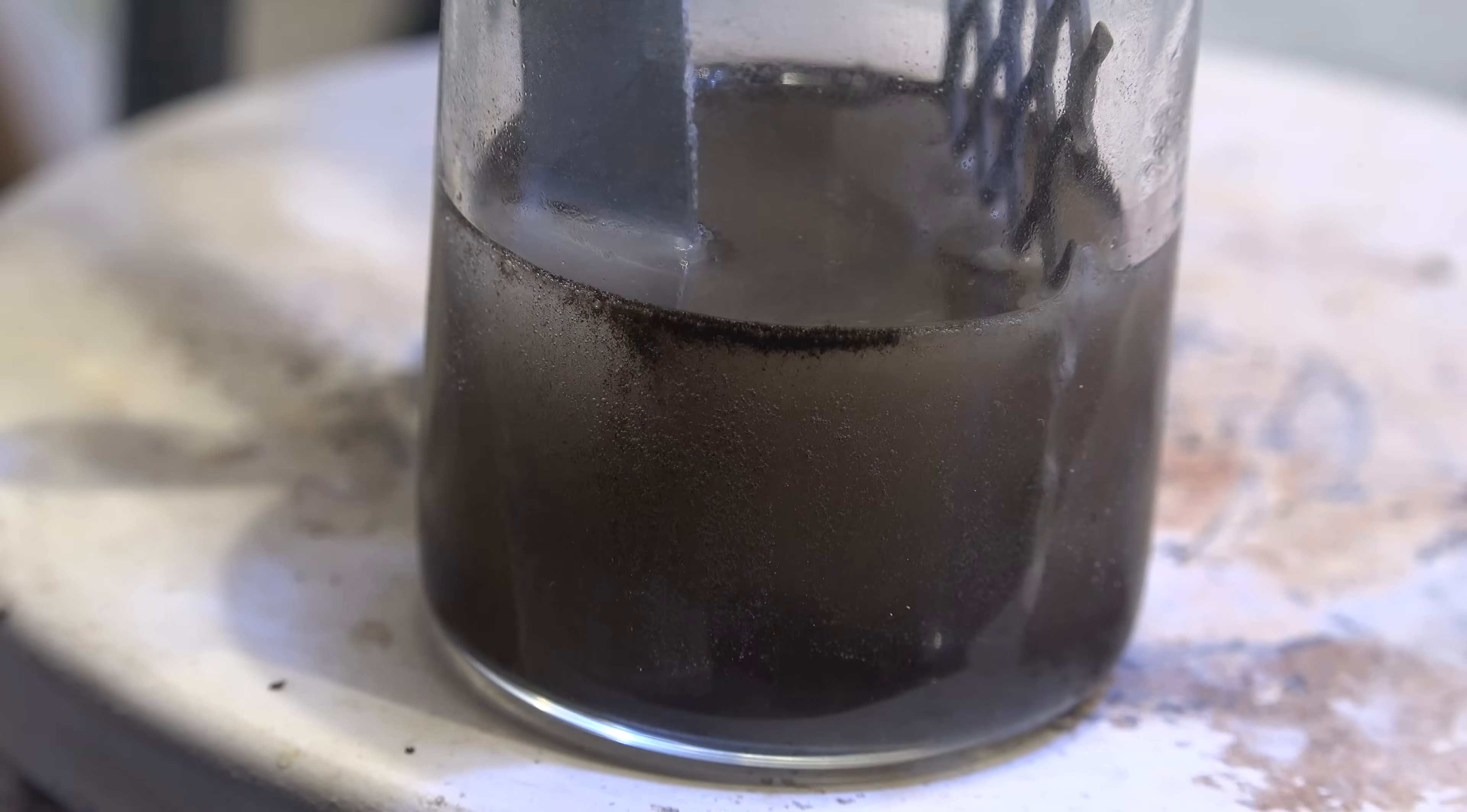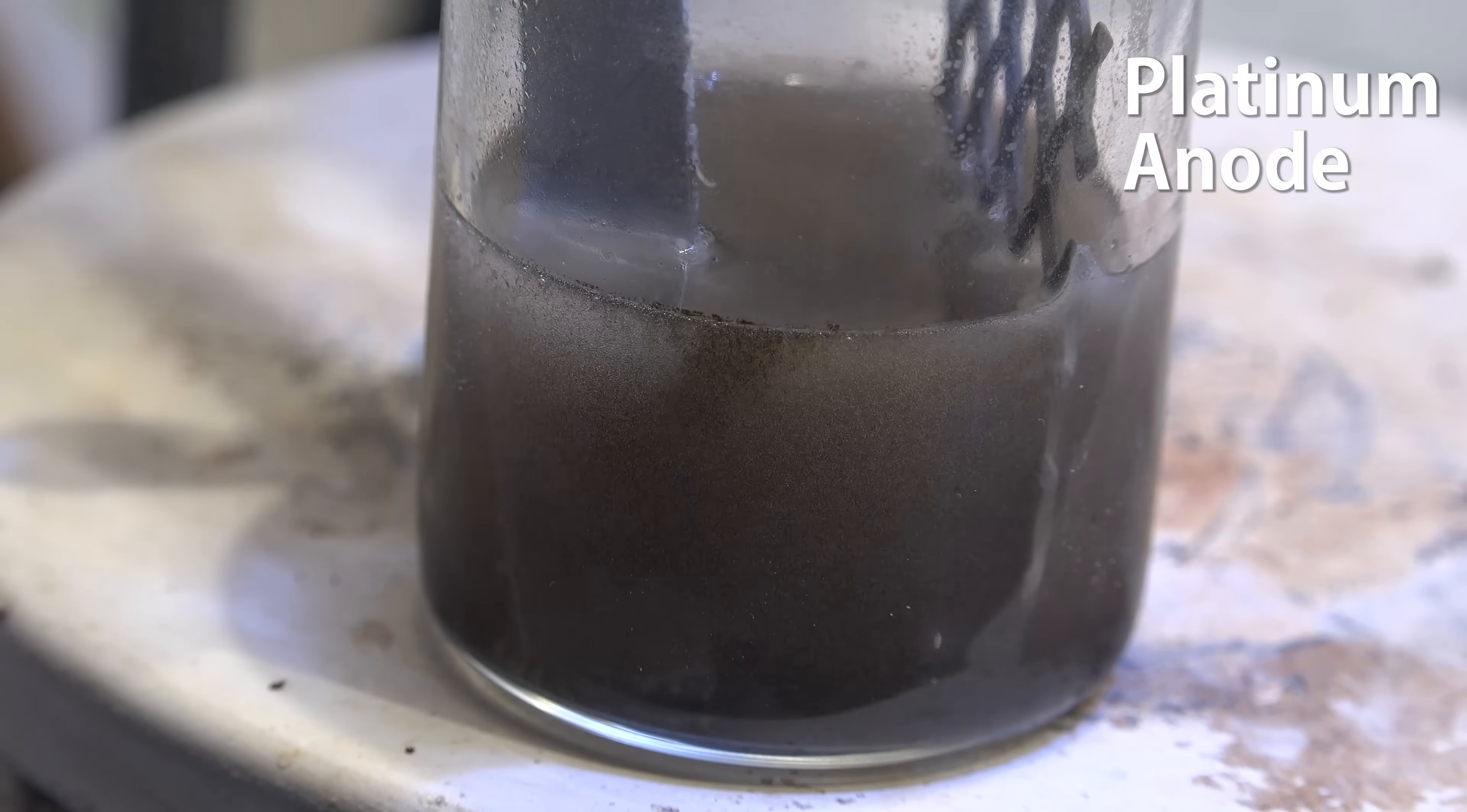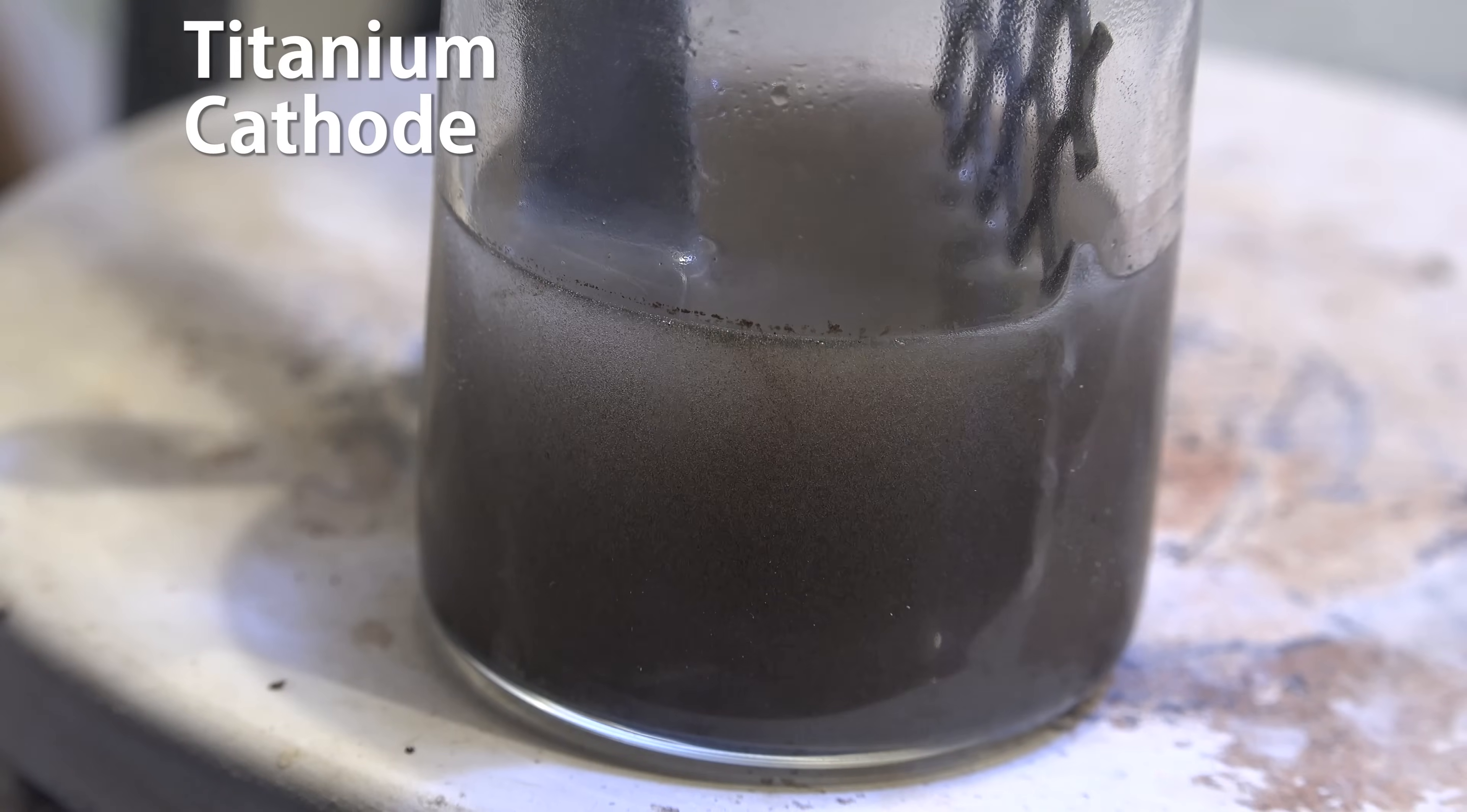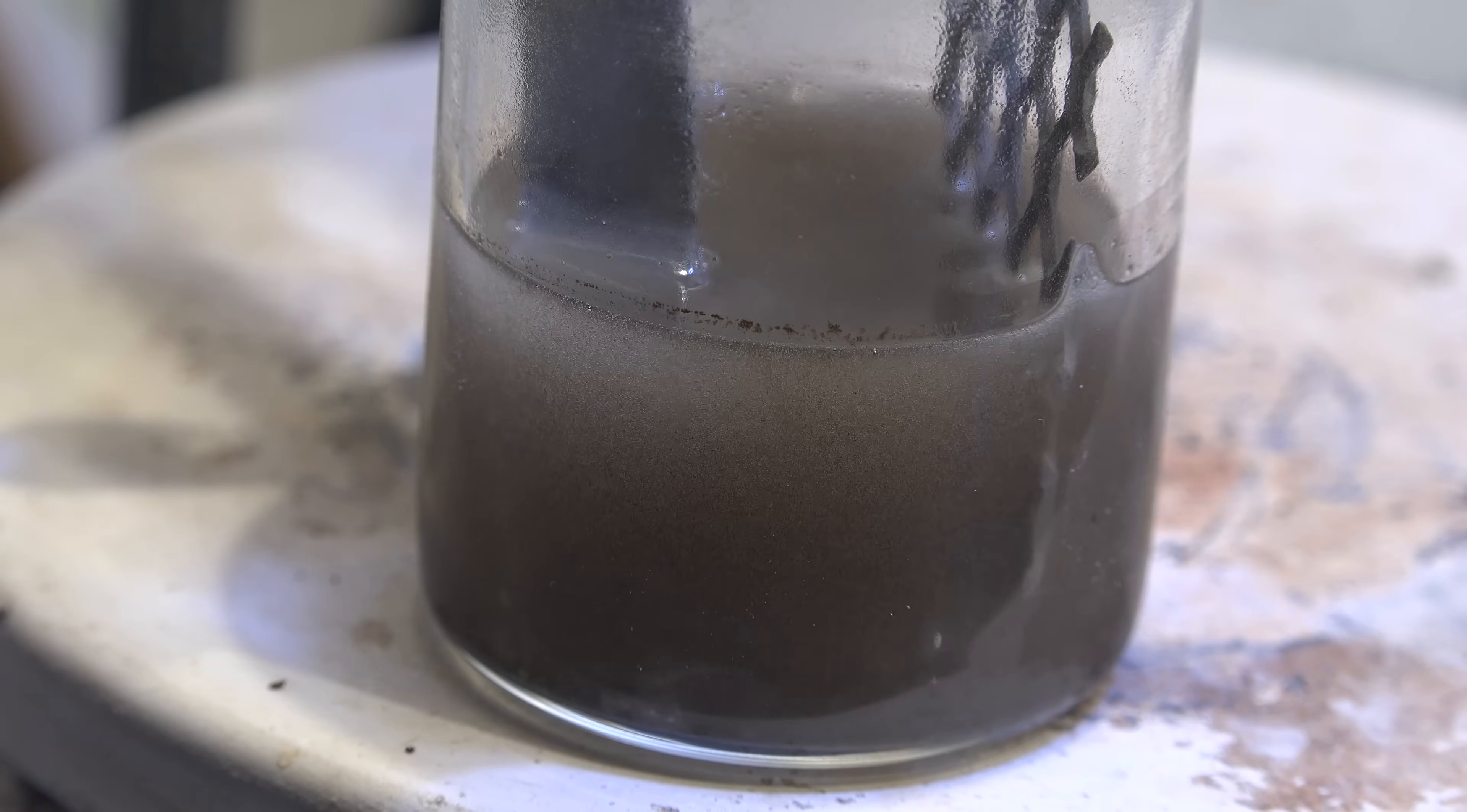Now to recover the actual gallium metal we set up for electrolysis. On the right over here is a platinum anode. You can also use nickel since we're working in strongly alkaline conditions. On the left here is a titanium cathode. But you can also use copper, nickel, steel and most other metals that are stable in alkaline conditions.